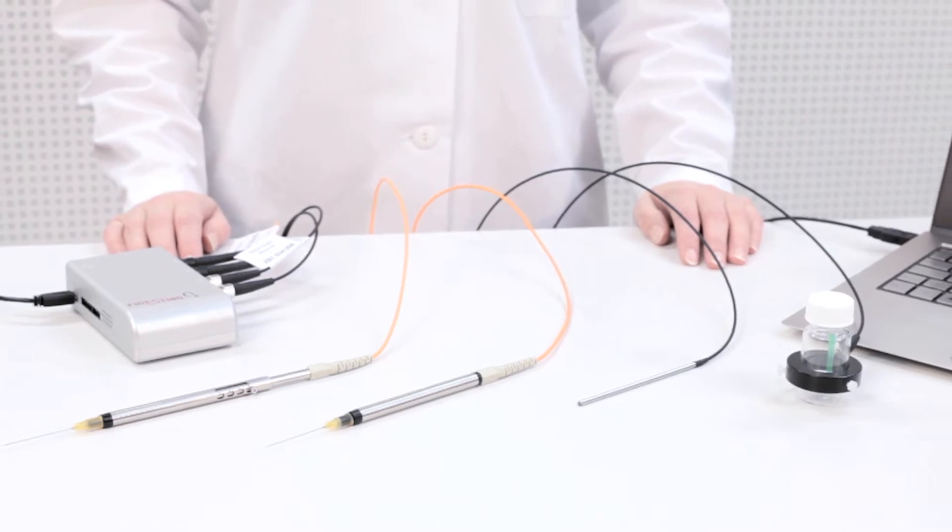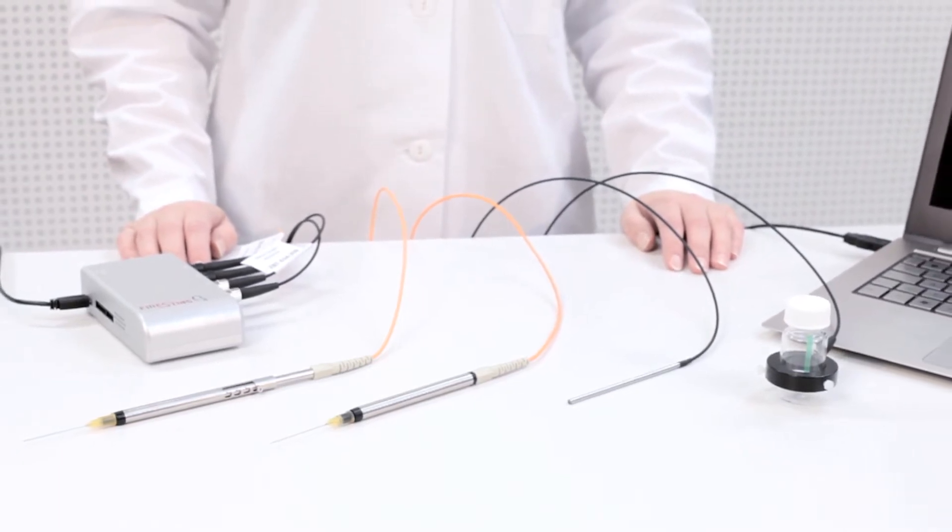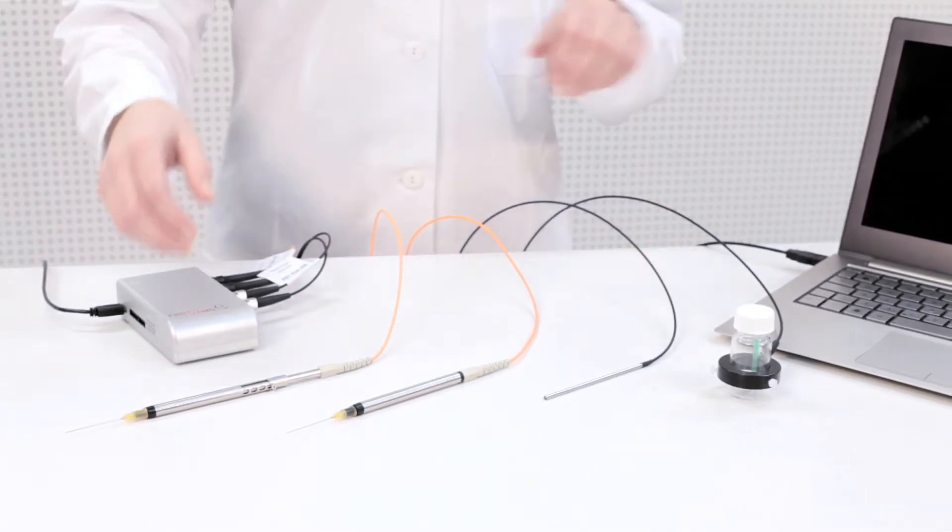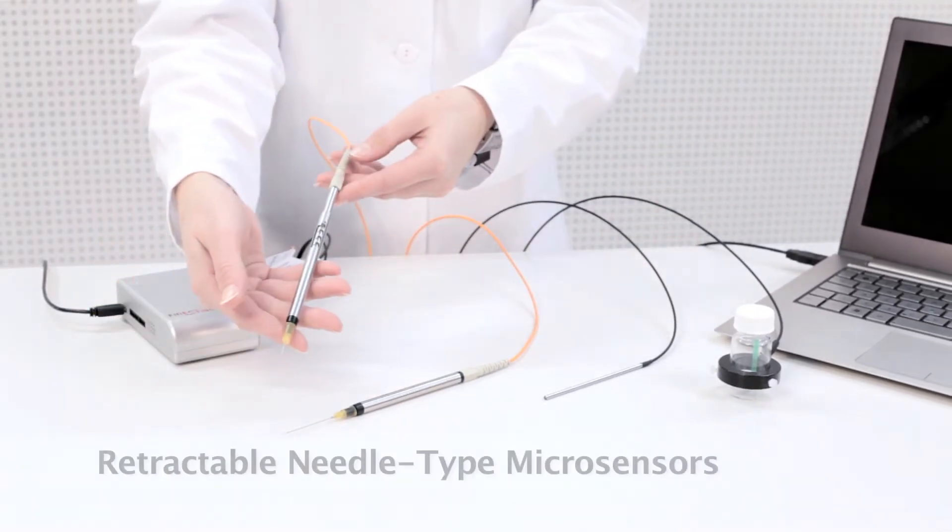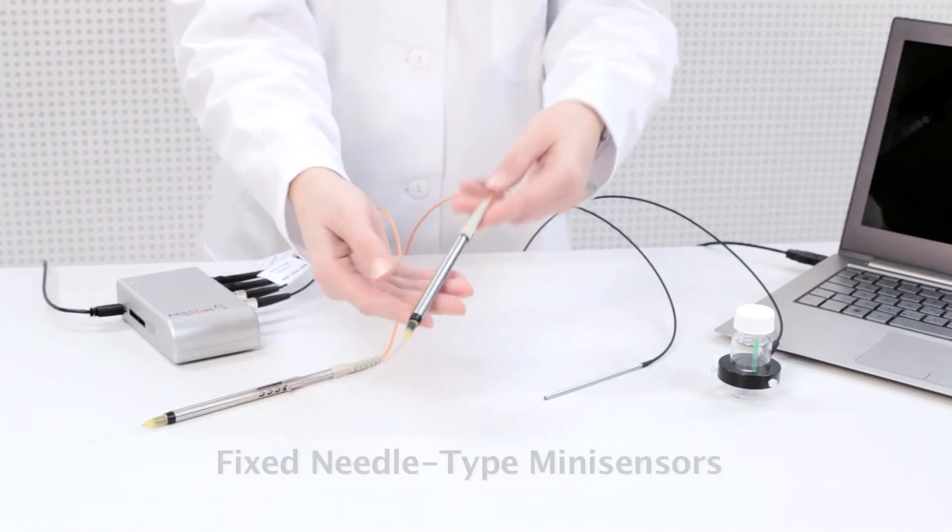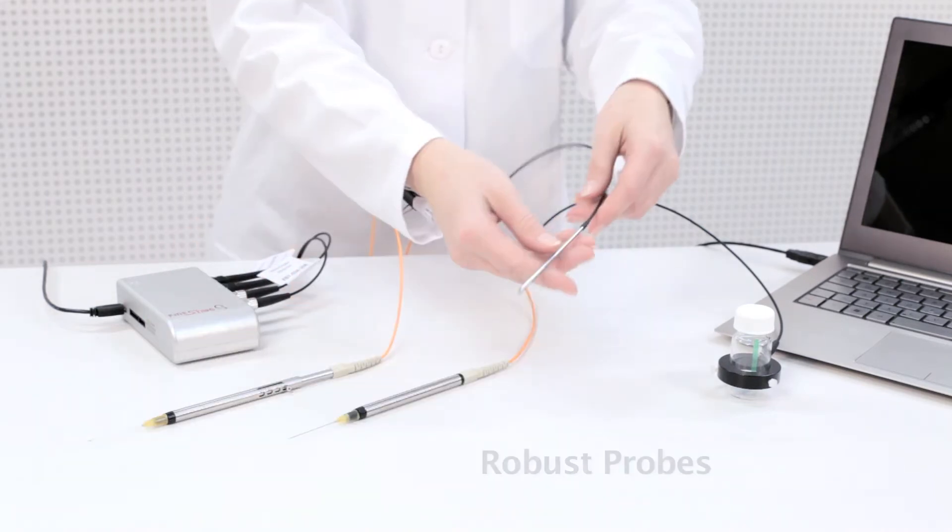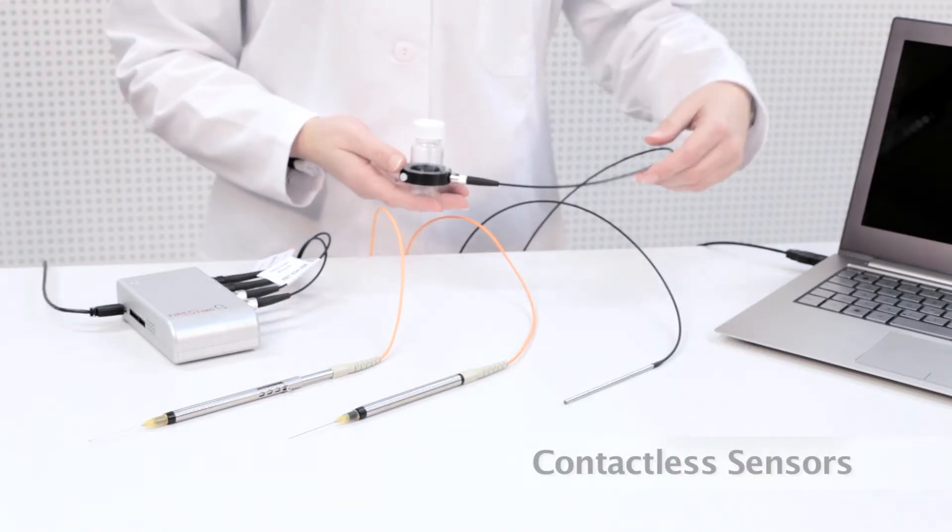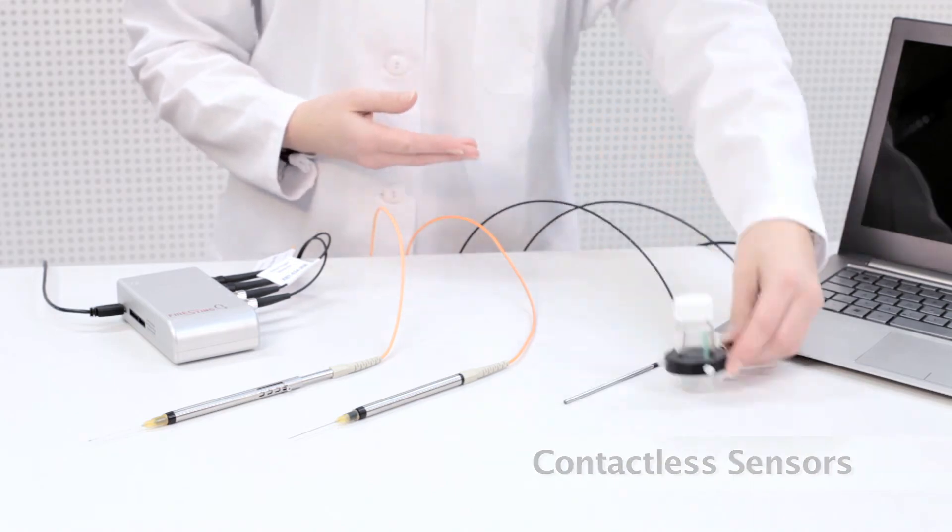And the Fire Sting O2 meter is outstanding due to its versatility, as it works with all oxygen sensors offered by PyroScience. This includes retractable needle-type microsensors, fixed needle-type microsensors, robust probes, and a number of contactless sensors like sensor spots, flow-through cells, and respiration vials.